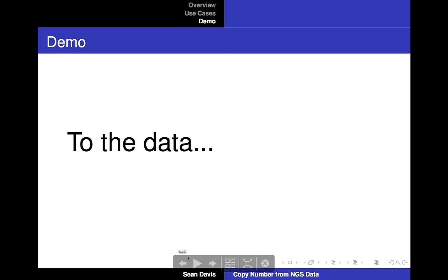Okay, thank you. Another question, have you done any exome CNV work on DNA extracted from formalin-fixed slides? I'm trying to think if we've actually formally analyzed them. We have done those things. I don't have off the top of my head what the noise characteristics look like.